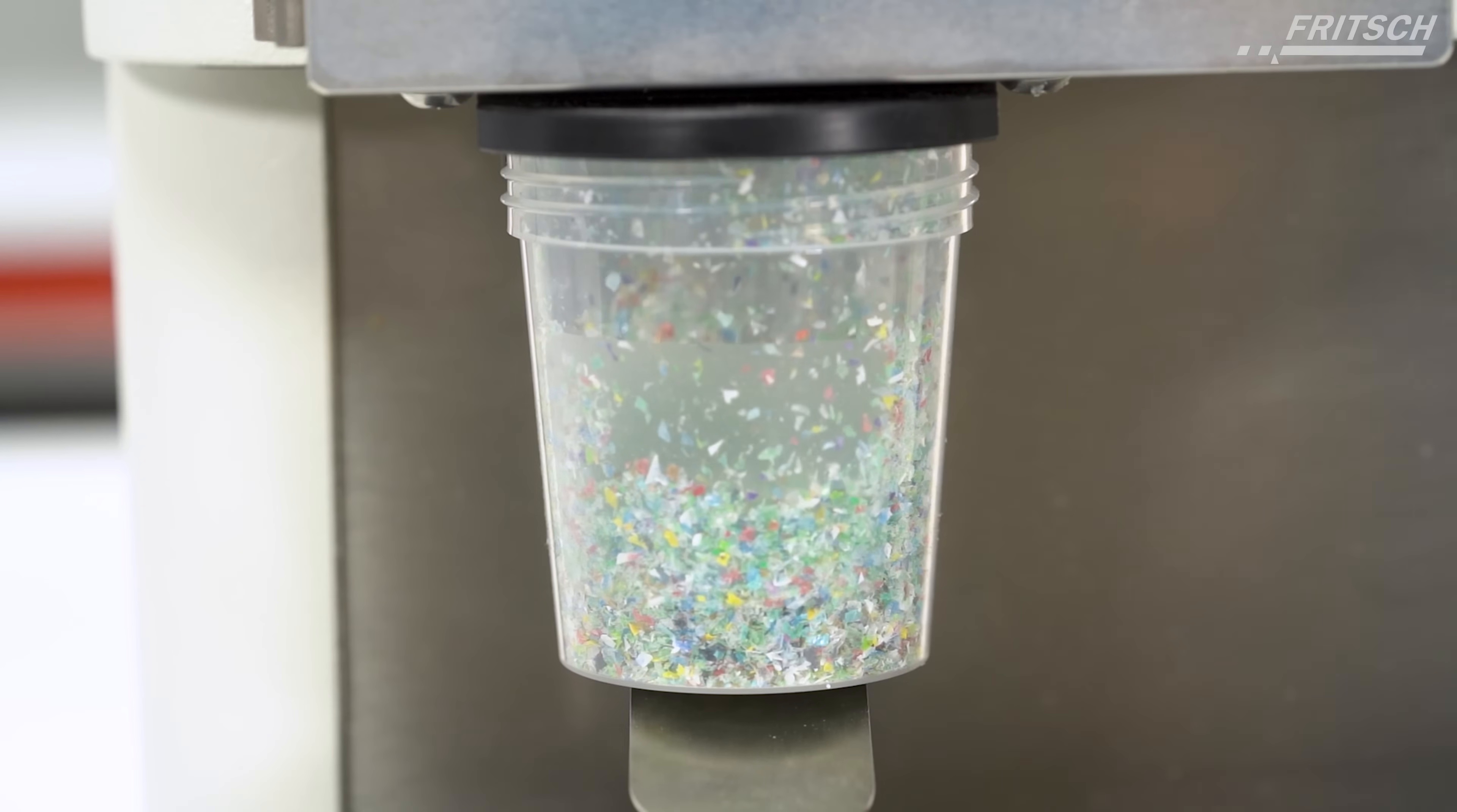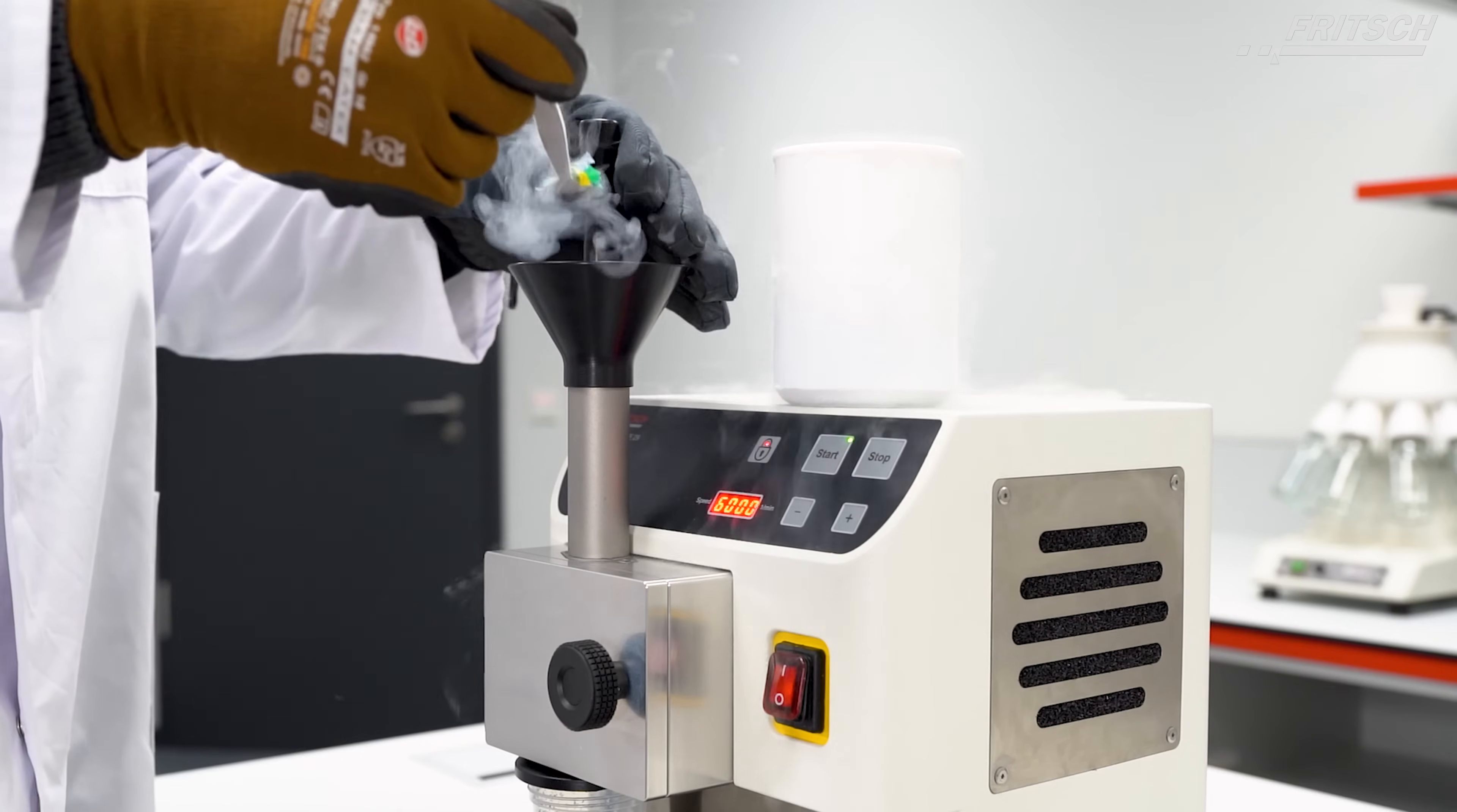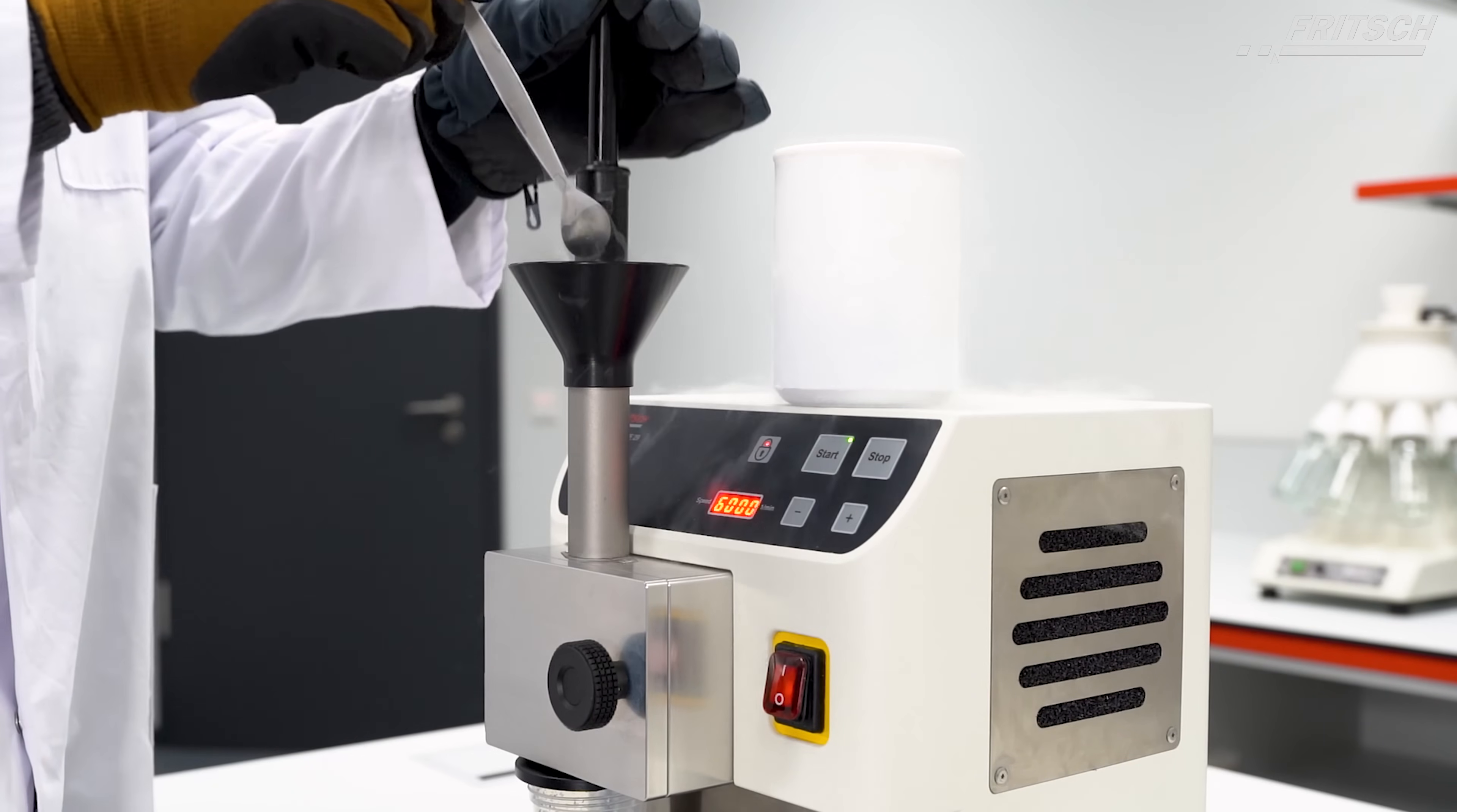Due to the advanced cutting geometry, the sample material, even low-density samples, is automatically transported, making the P29 the perfect solution for milling plastics.